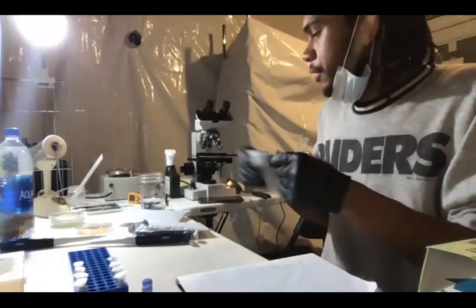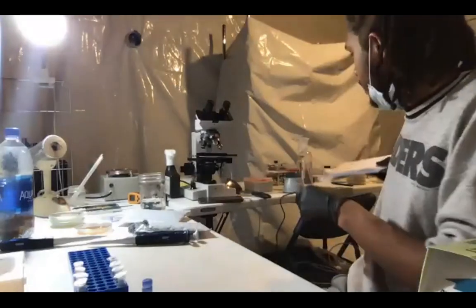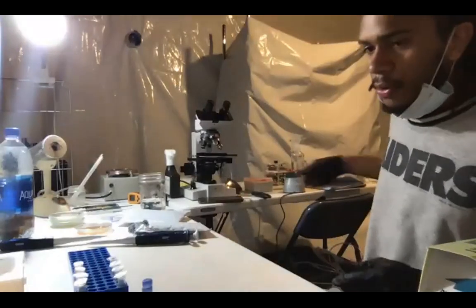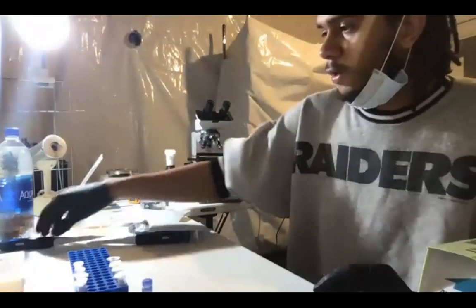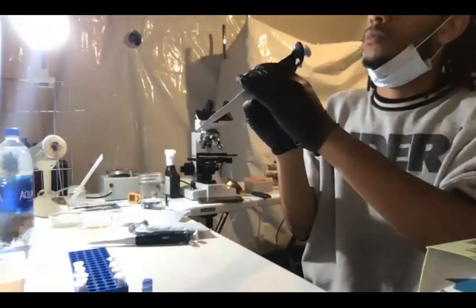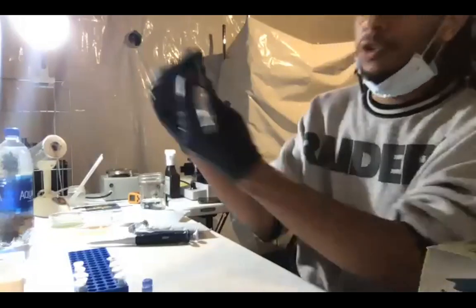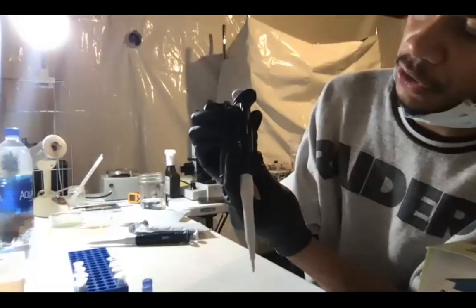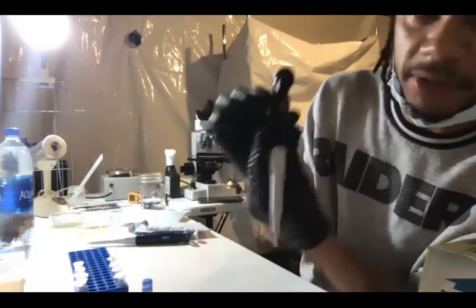All right, since we don't need that much of these, I'm only going to dilute them. They're 10 times concentrated, so I can put 1 microliter into 10 microliters of water. With the smaller pipettes, it does half numbers too. So just make sure the half number is at 0 if you want it to be just 1. That's set at 1.